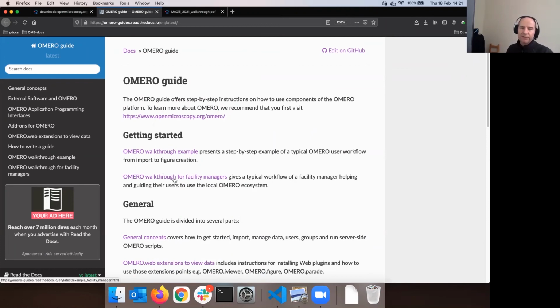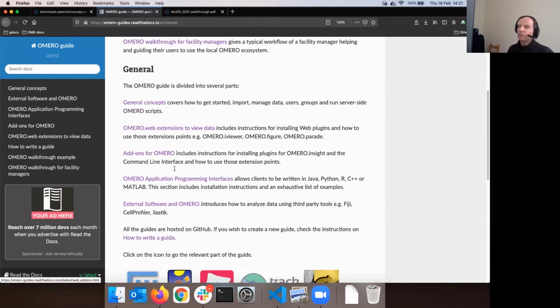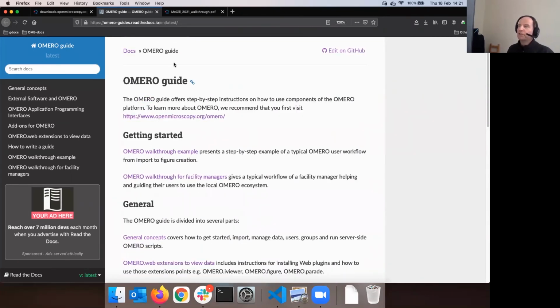That's where you find the stuff. Okay, we have a walkthrough as well, which is a PDF. I will show you in a second, but a reasonable person will, after a minute, realize that they don't need to walk through. It's actually restraining them. The Omero guide is kind of a world per se, and they can use it using this search function.